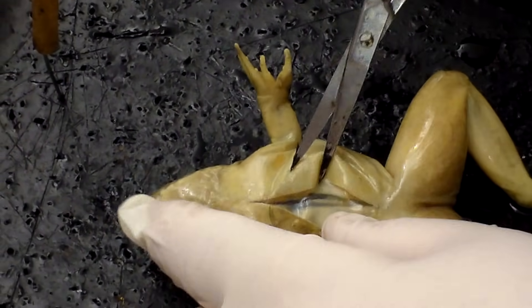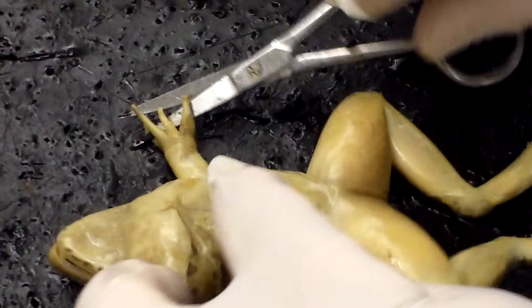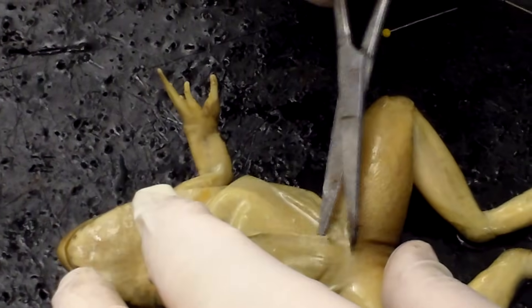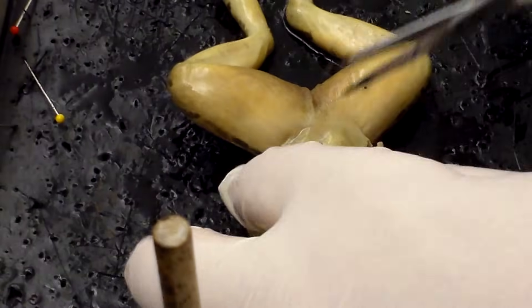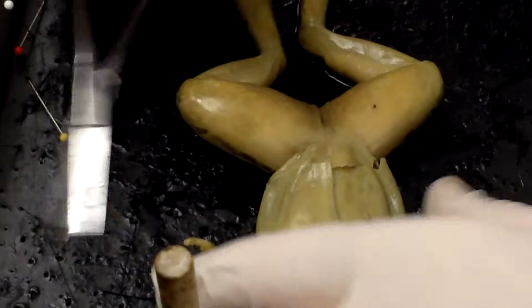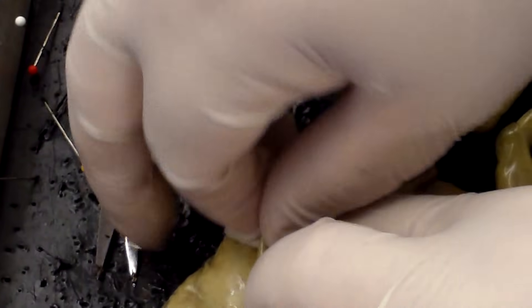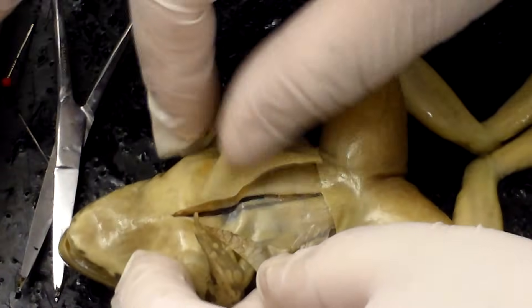We can pull the skin back and see that I did make an incision. Here's the layer of skin and underneath you can see the layer of muscle. The muscles of the frog's abdomen look very similar to ours — you can see some definition between the different muscle groups, and the frog actually has a little six pack going on there.